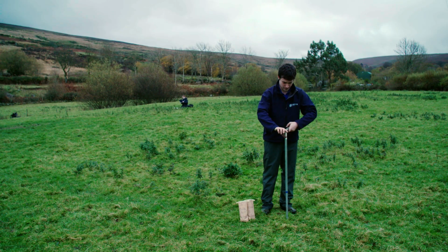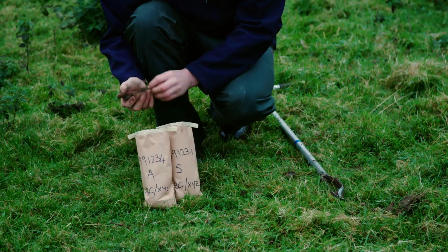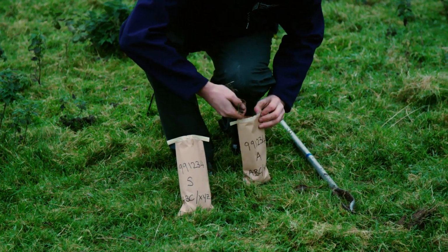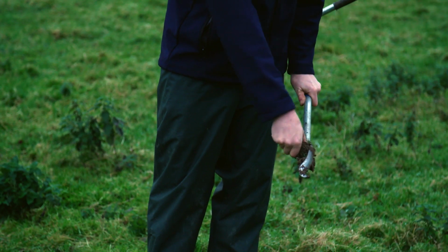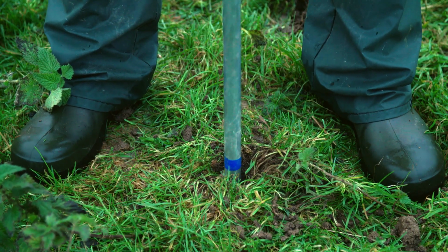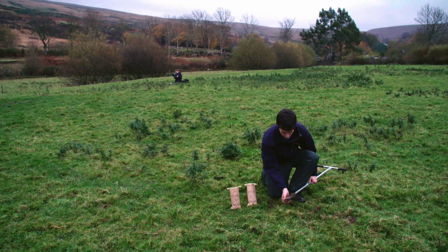First, a topsoil sample from an auger flight from just below the surface, nominally to 20 centimeters depth, known as sample type A. Next, an intermediate flight, which is discarded. Finally, a subsoil sample aiming to reach 50 centimeters depth, known as sample type S.